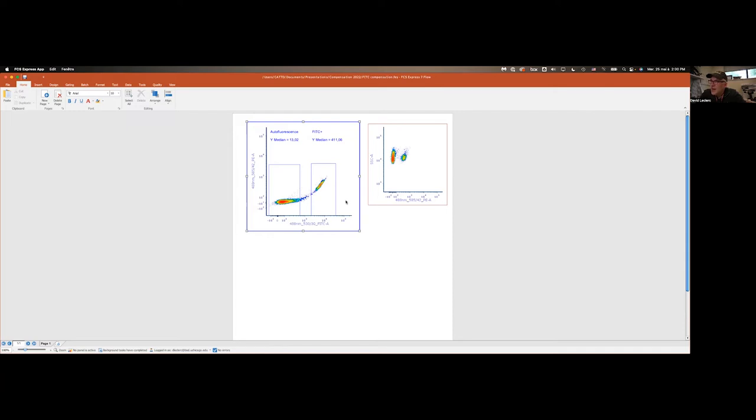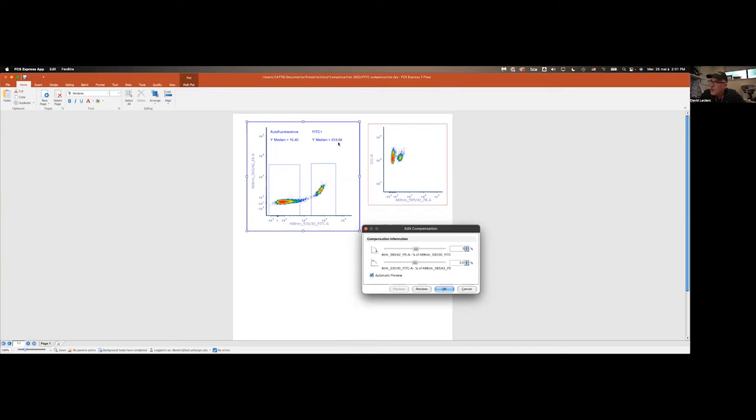In FCS Express, I have this compensation tool. I have a matrix called You Shall Not Spill that will allow me to subtract a percentage of my FITC signal bleeding in my PE channel. As I increase this value, we'll see the median value go down. If I go to 3%, I can see that the value shrank to about 233, and my artifact is slowly disappearing. If I go to 5%, still not quite there. The artifact is still present but slowly going away. My median is now at 115.